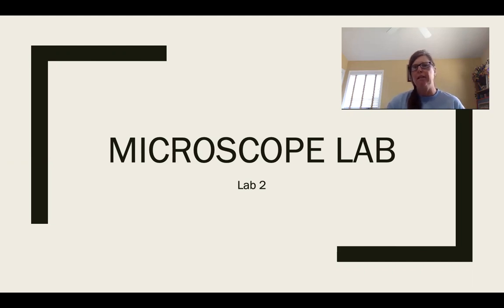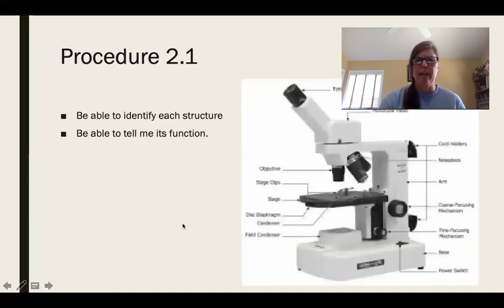But more importantly, when I tell you to put your slide on your stage, you need to understand what I'm telling you. You also need to know the function of the stage, which is to hold the specimen. So you need to know both the structure and the function.